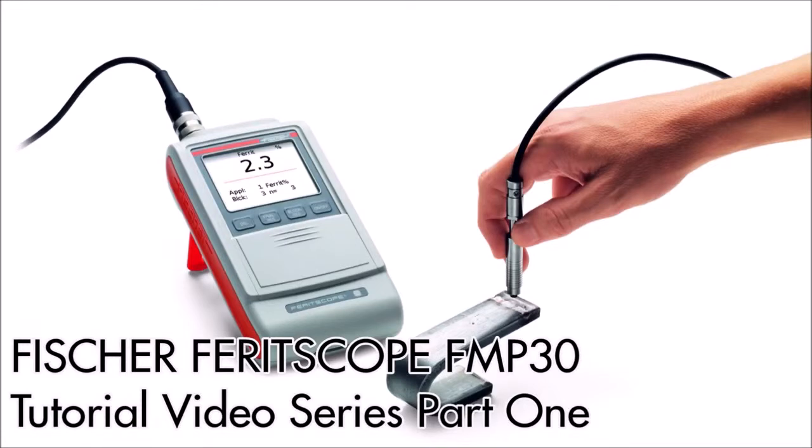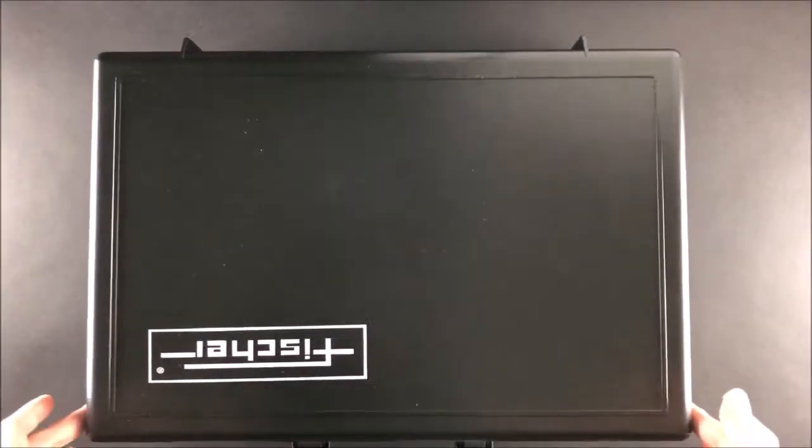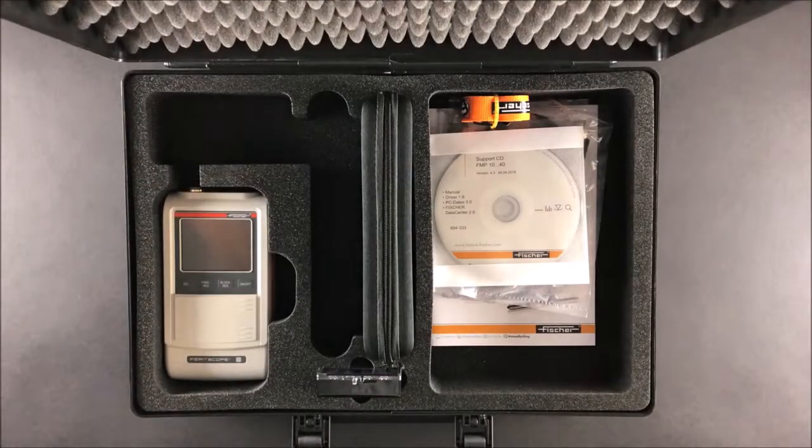Welcome to Helmut Fischer. Today I will be introducing the ferrite scope FMP30. This is the casing the ferrite scope will come in, which includes the accessories you need for calibration and data transfer.